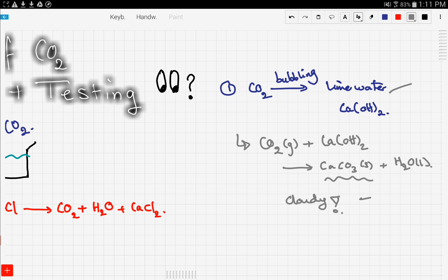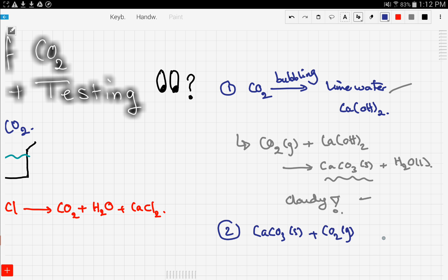Notice that if you keep bubbling CO₂ into the solution, the solution becomes clear again. This is because calcium carbonate reacting with more CO₂ gas gives calcium hydrogen carbonate, which is soluble in water. So bubbling more and more CO₂ into the solution makes it turn clear again.